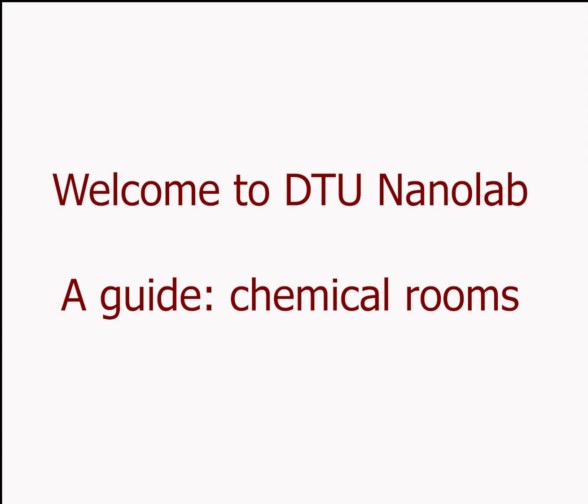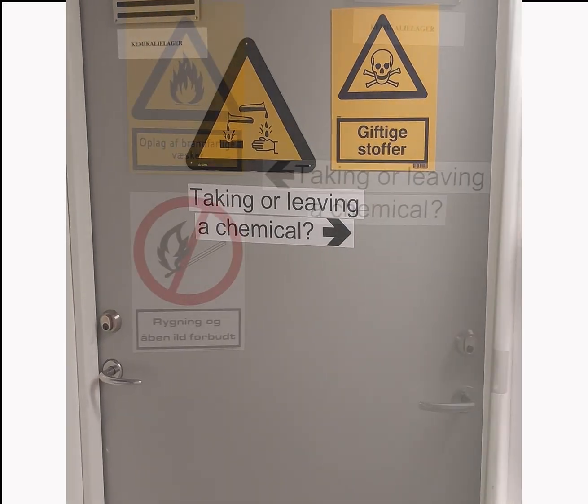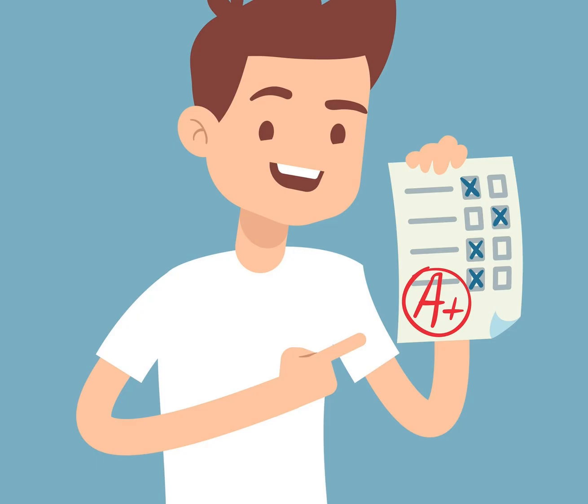Welcome to the DTU Nanolab chemical rooms. In this video, we will provide an overview of the rules for using the chemical storage rooms. At the end of the video, there will be a short test to reinforce what you've learned.